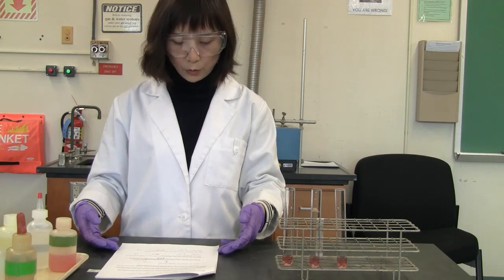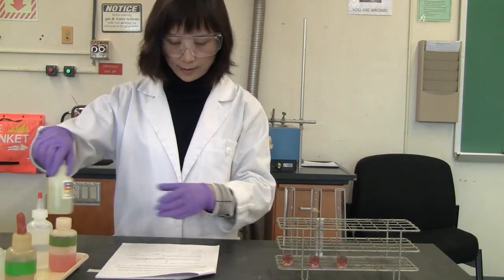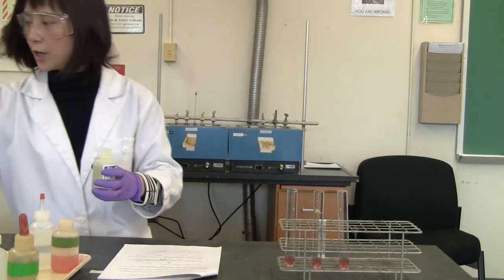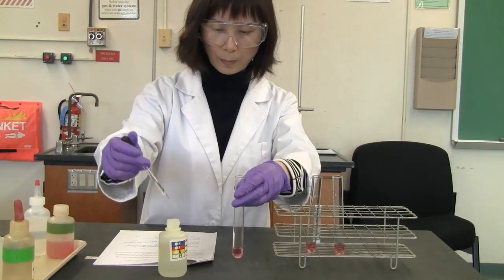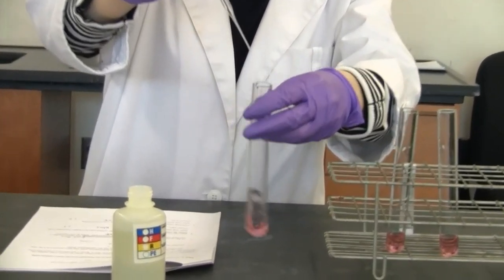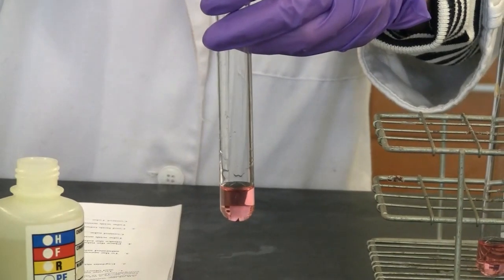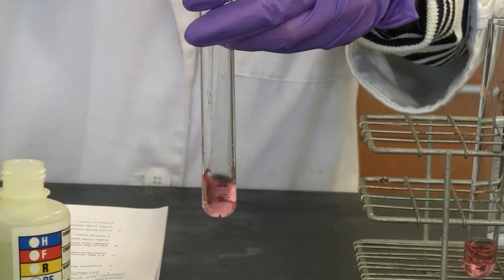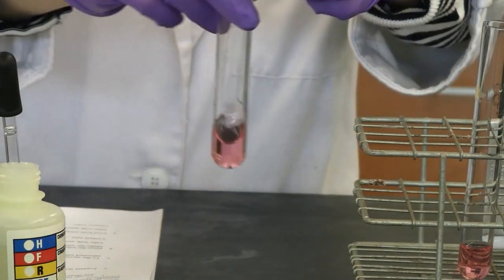To 1 tube, add about 3 milliliter of concentrated hydrochloric acid, 3 milliliter, dropwise. Then you're going to see the color change gradually. Let's compare with the original.